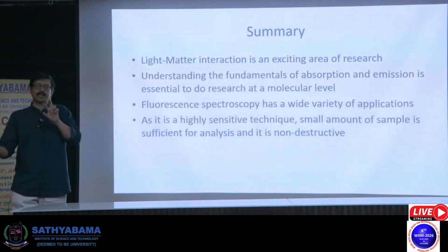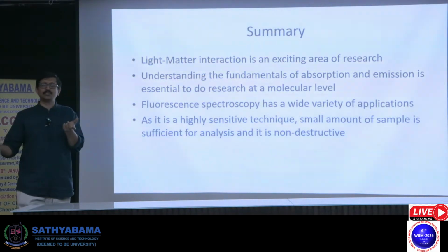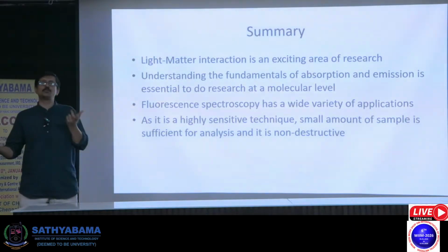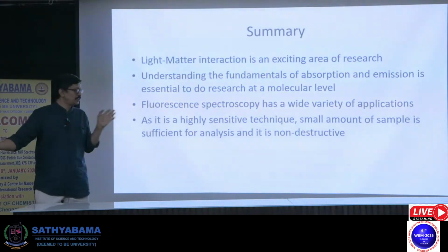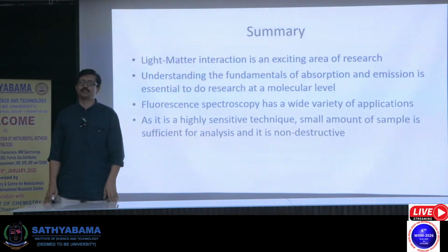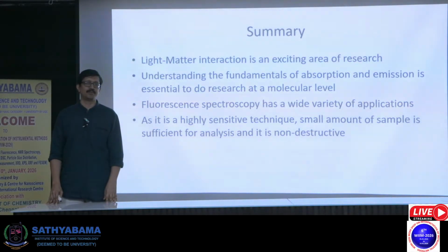Because of these two attractive things, and because it is highly sensitive, you can detect and analyze in parts per million, parts per billion concentration. Very small concentrations you can work with to sense some of these things. So with this note, let us wind up because time is up. And if you have any kind of queries, questions, please ask for the next 2-3 minutes.